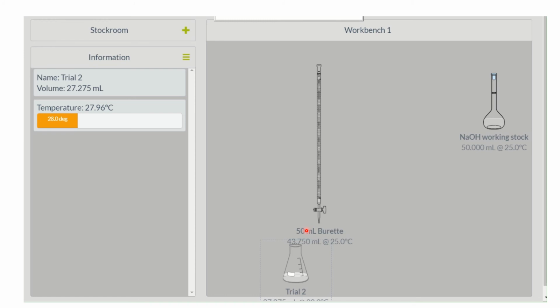So you're going to first add a little bit. You start off with a bigger volume, like 1 ml, and then slow down, change it to 0.5, add some. If you feel like it's going too slow, or you feel like you're reaching the end point, like you're scared it might happen soon, then just go slower, go 0.25. It's okay if it takes long. On the next trial, you'll have an idea of how much volume it took to reach that end point. And that's how you gauge, okay, should I keep adding in 1 ml increments? No, because I know the end point is coming soon, so I'm going to add in 0.25 ml increments, and so on.